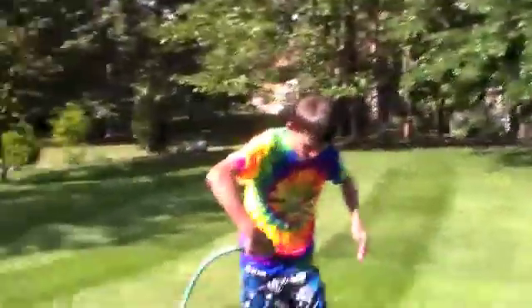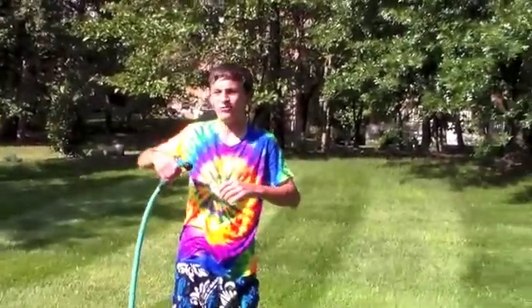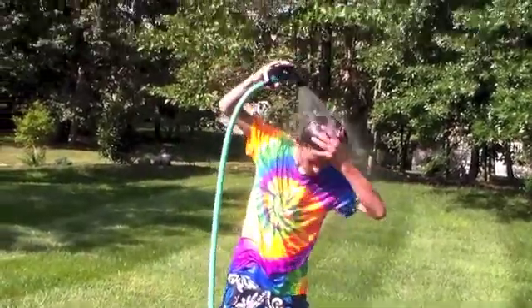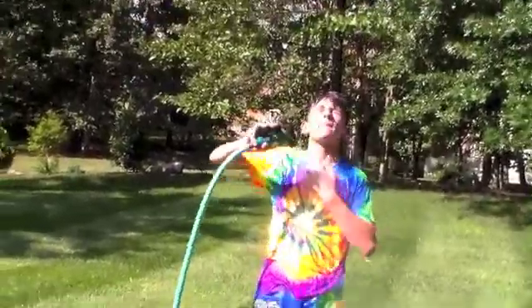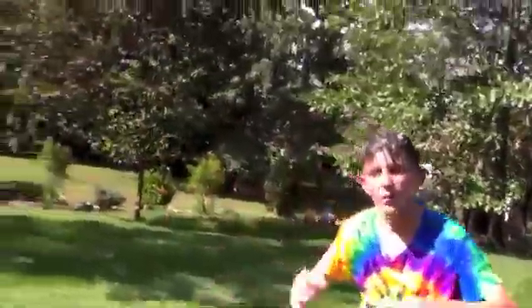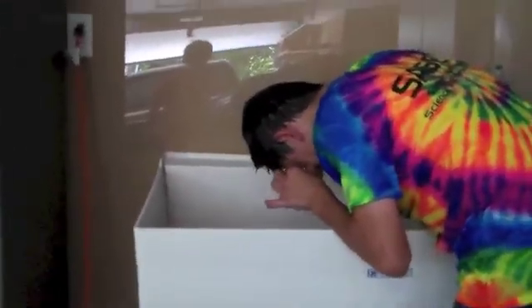You're going to keep rinsing your entire body. You'd probably take off your shirt — I'm not going to for the sake of viewers. Just keep rinsing all parts of your body, get everything off, and keep rinsing. After that's done, we're going to go back to the eye wash and keep rinsing out our eyes. You still have sulfuric acid in them because you decided you're too cool to wear goggles.